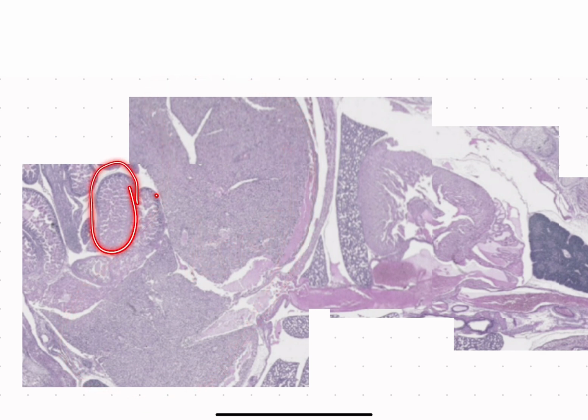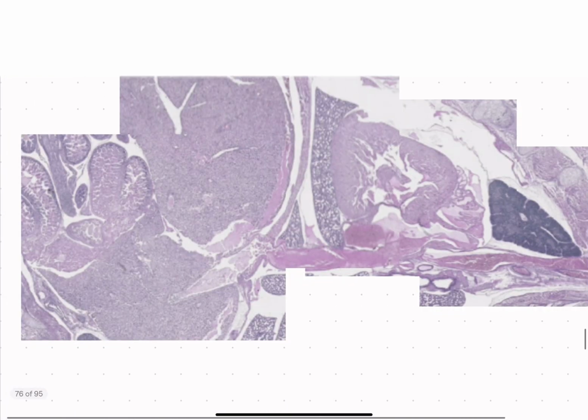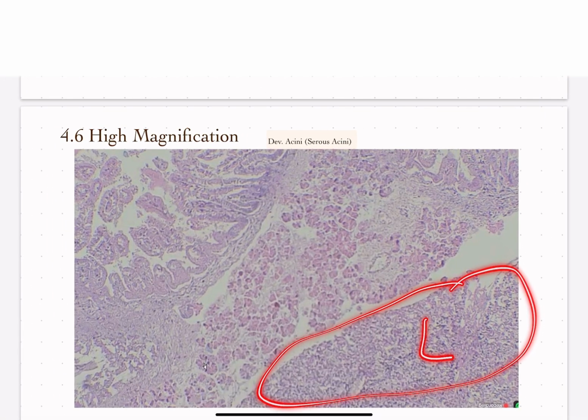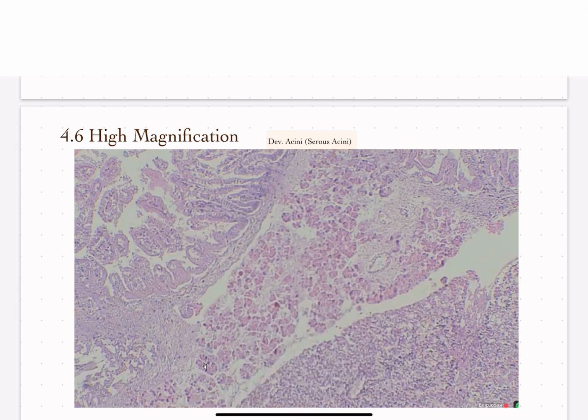And then we have, I would say, recanalization of intestines as well, because it has all of this going on in the lumen. But this tissue right here is known as the pancreas. Now if we zoom in further, we can see here this being the liver, this being those recanalizations of intestines, and then this is the pancreas.